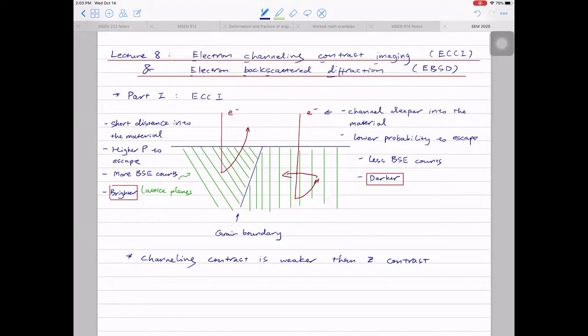If you have a very well-designed alloy, or some ceramics that are single-phase materials, and you polish your sample really well, then you put the sample in the SEM and turn on the BSE detector, you will see different grain orientations if you have done a really good polishing job. The second note is that we can use this information, but the information is qualitative rather than quantitative. So qualitative orientation information.